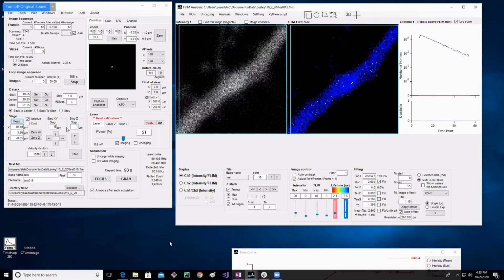Okay? So the best way to see this is zeroing it at the spine that you're wanting to record from, then pulling back. That's how I do it. If you prefer to zero it at the top of the slice and then go down to where you're focusing, it's the same thing. Okay. But usually I look at my spine first, and I usually hit 0Z and then go up from there.